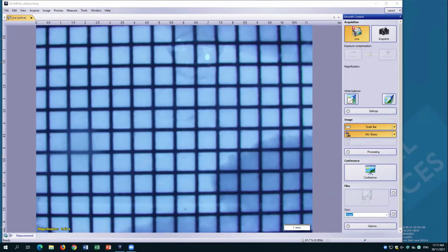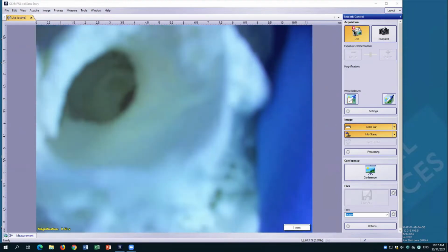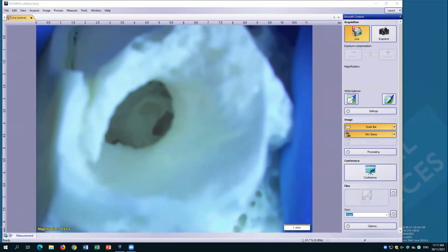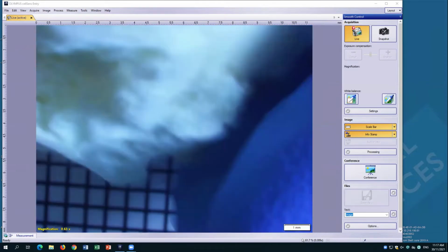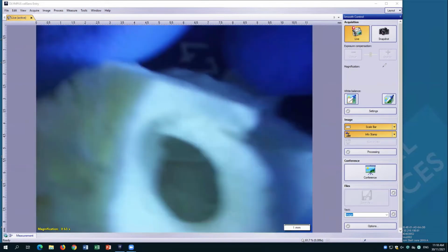So this is a human ear bone, similar to what I had for sheep, trimmed right down so that we've got an ear canal and the cochlea. Now sticking this under the microscope, this is an ear canal here. And if I go up and down, you see there? So that's your round window. I might just rotate it around. So this is an ear canal, and maybe that's better.